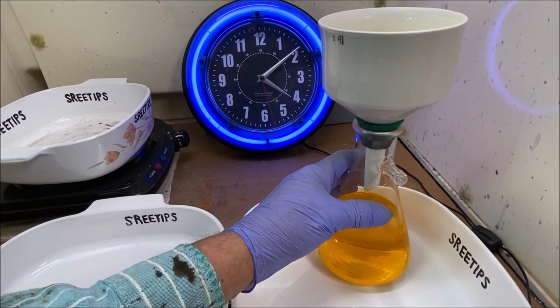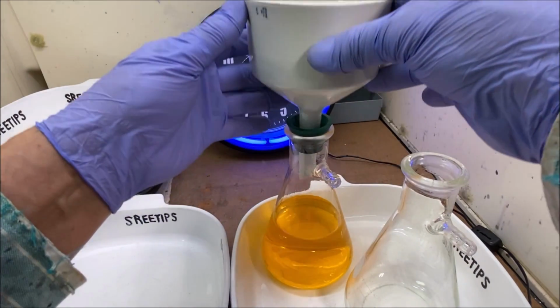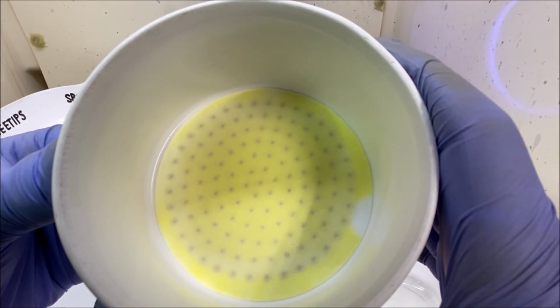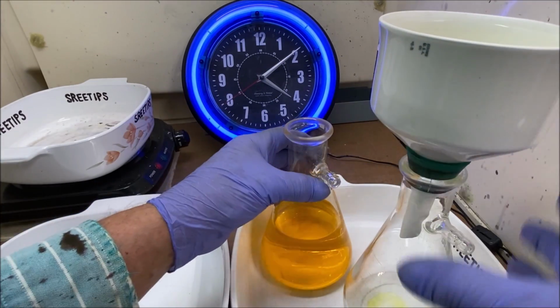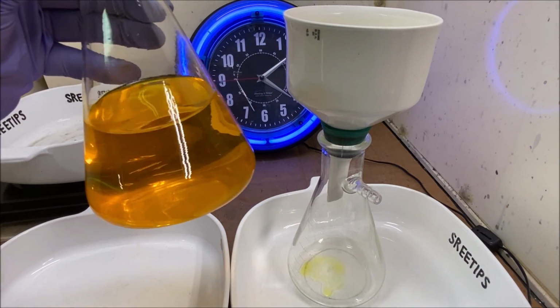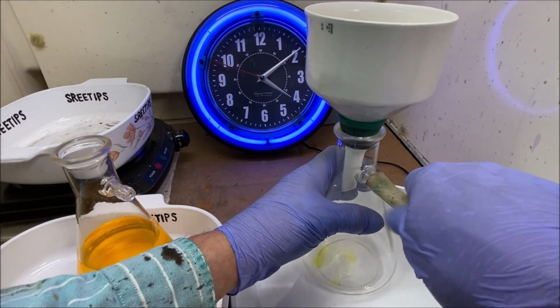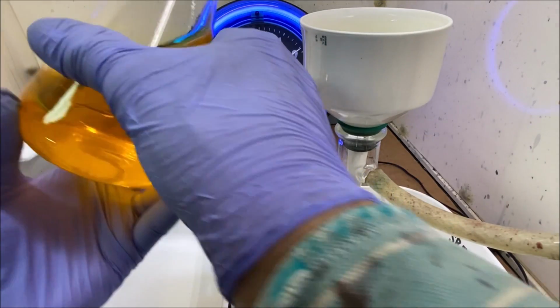We're gonna pour this back through the same filter paper a second time. You can see it's loaded up now, probably silver chloride. So what we'll do is pour this solution, it's a little bit cloudy, back through the same filter for a second time. See if we can get this cleared up.